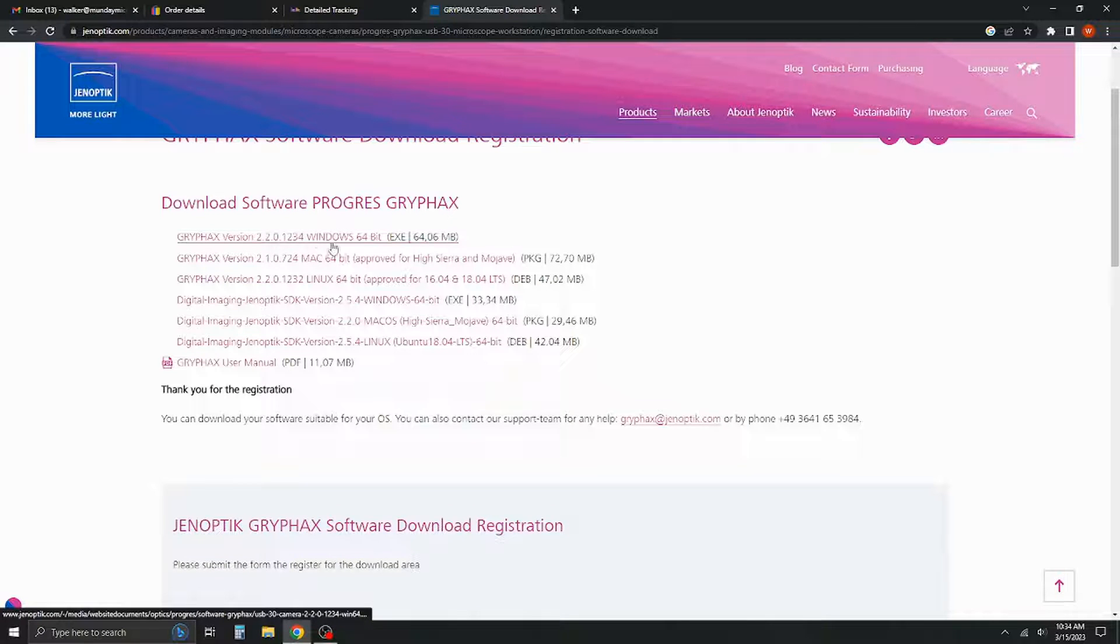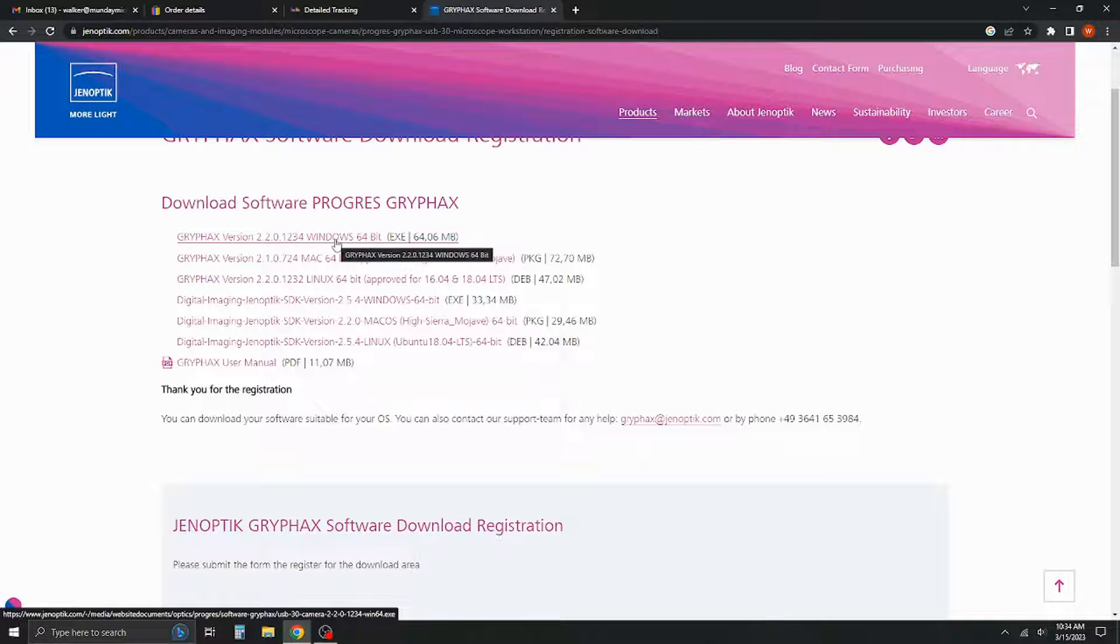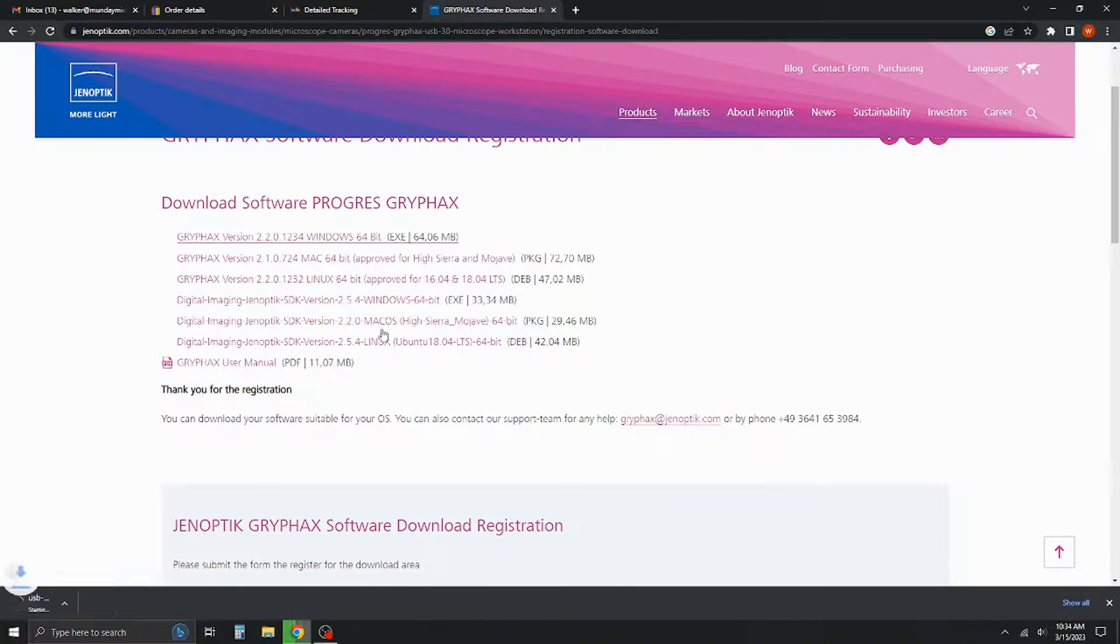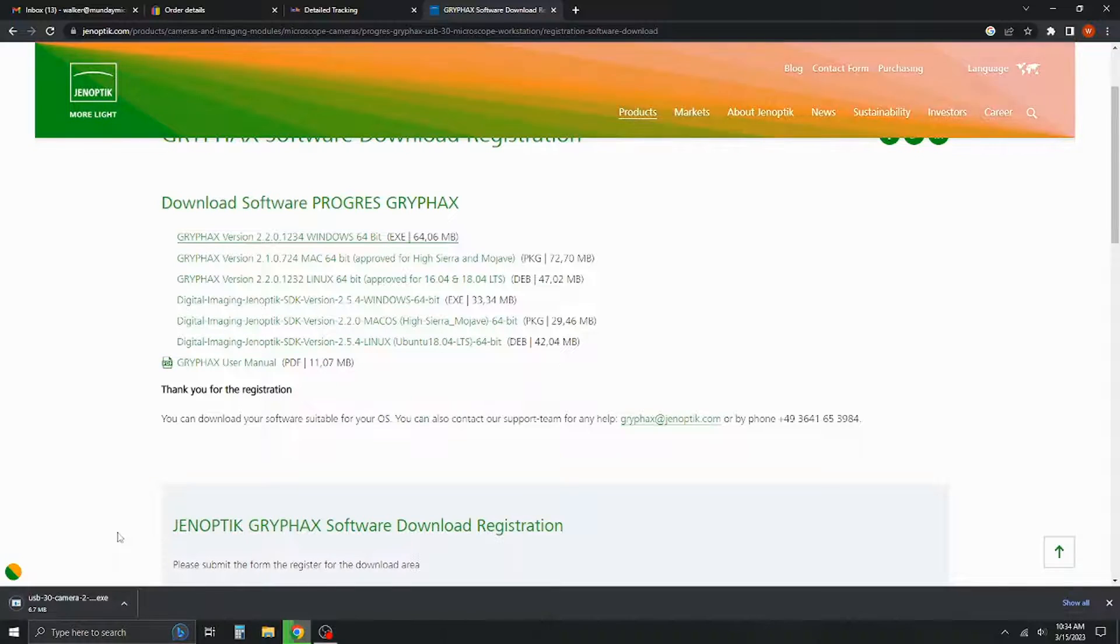We're going to go ahead and take the latest version, the 64-bit for Windows. We're going to click that and it's going to pull up a little prompt and it's going to go ahead and start downloading for us.